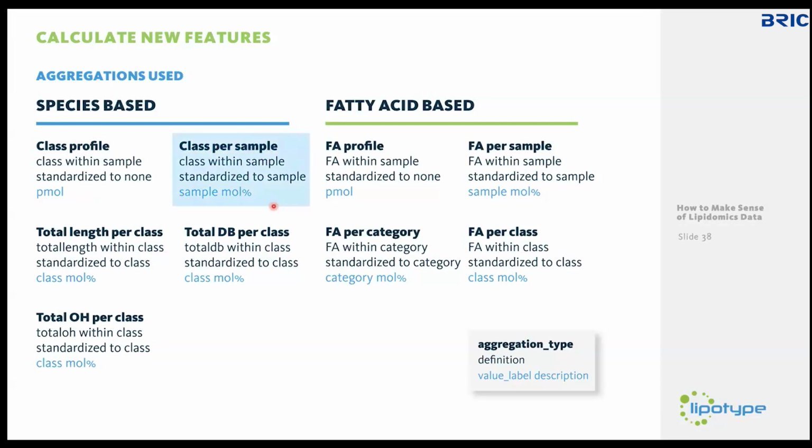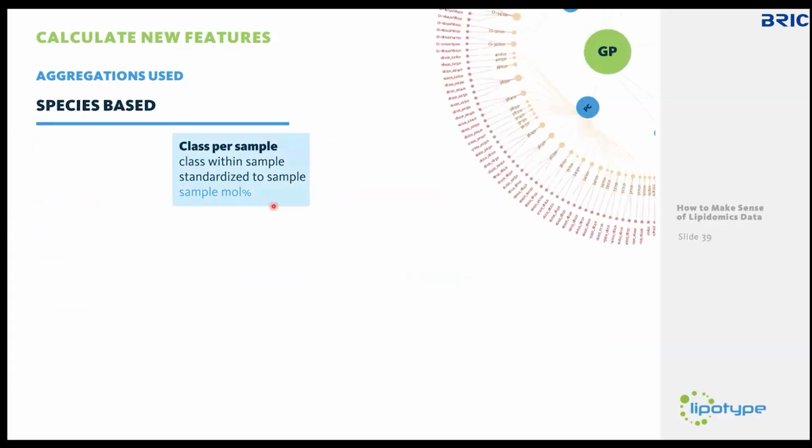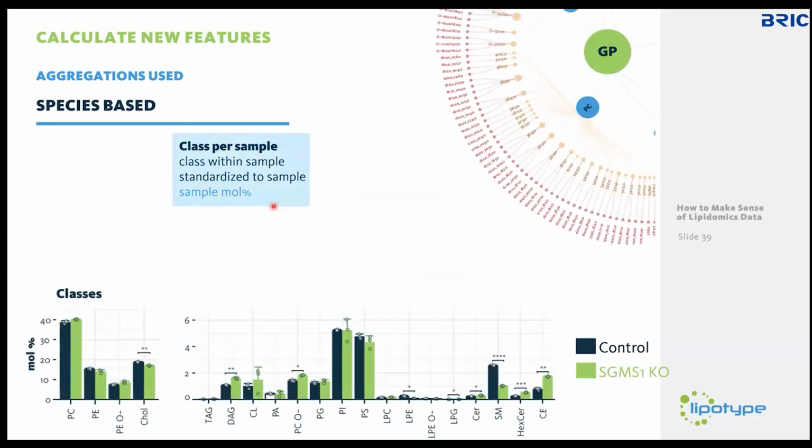And if you look at this one now for what I just told you, the sphingomyelin synthase knockout, then this is what it would look like. You would actually get, for the free samples that we have, a bar or a value of the sphingomyelin synthase knockout and one for the control. So basically, you're taking all the lipids within one class and put the value into the class.